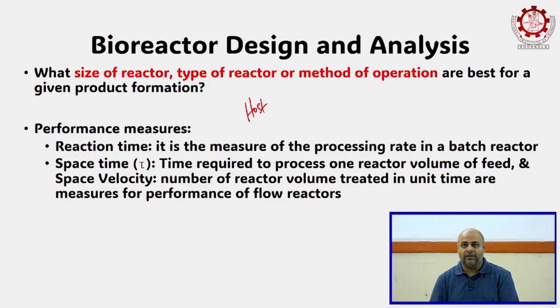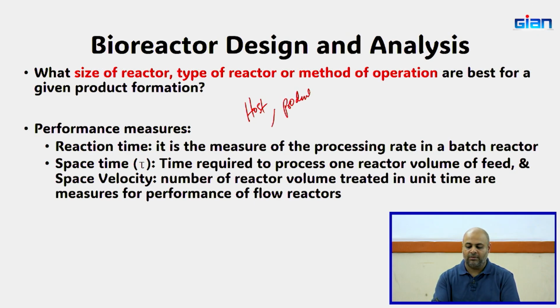What else would be there? The host, the product, you need aeration or you don't need aeration. Do you need mixing, continuous mixing?